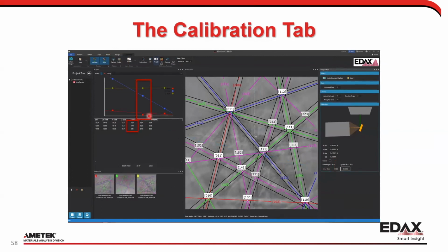Now, when I do this calibration, honestly, the key thing to look at is going to be the error bars. Here you can see that I have X star, Y star, and Z star values, and then I have these values here that are errors. When I look at these errors, you can see that they're usually relatively low. And here you can see this is a nice lazy calibration of 3 points.